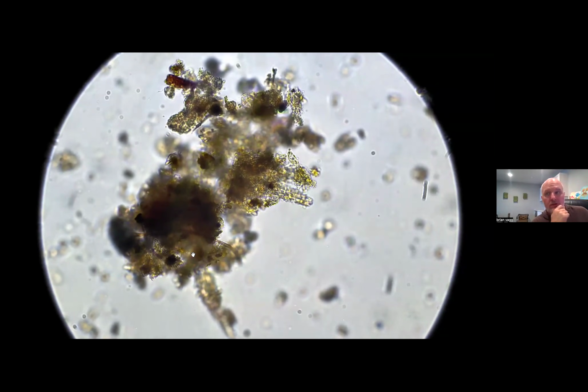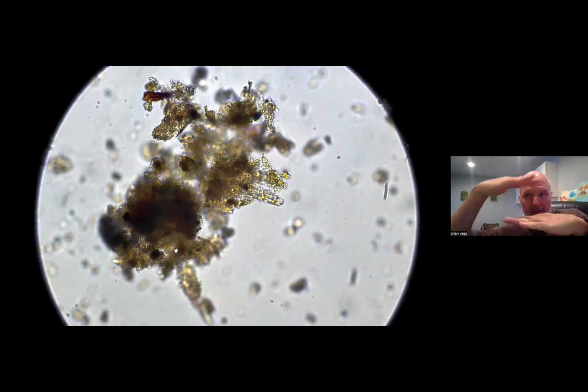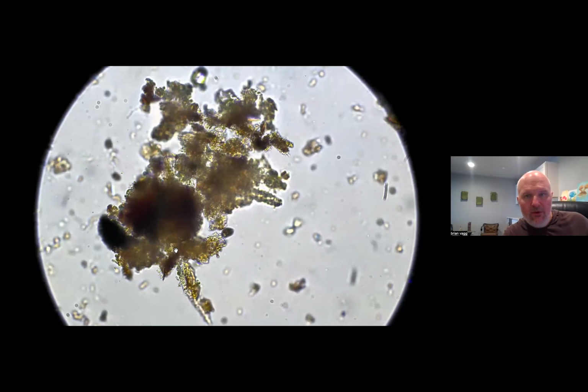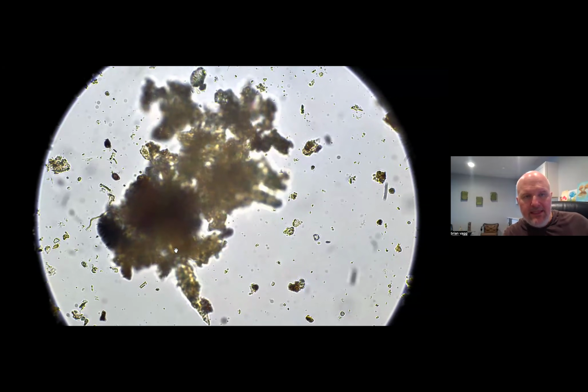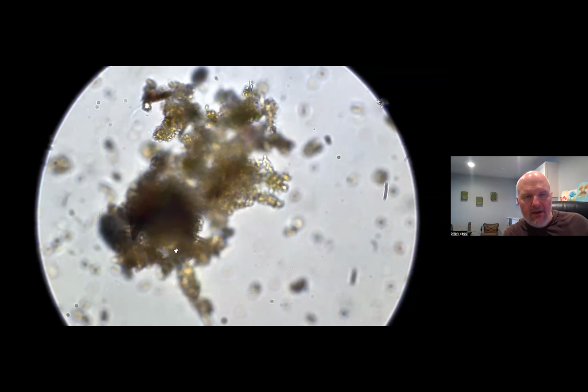And it's really important when you're using a microscope as well to go through the entire focal plane. So the way I like to describe it is think of my hand as the microscope slide and my other hand as the cover slip. You have a volume of liquid that contains that sample. That's that drop that I put on the slide. Well, it's not just completely flat. There's a column there. And so we use the fine focus knob to move through that focal plane so you can see different things. You notice as I go through that focal plane, I can see different things. In fact, there's a little flagellate, I think, moving around, and there it goes. It just moved right into the aggregate, right into here.